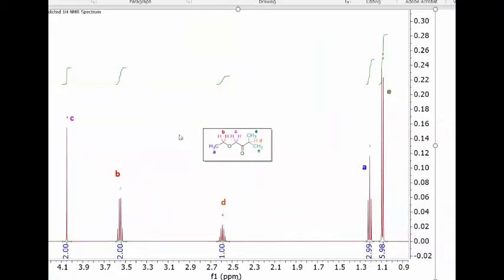Fine. So just to formally go ahead and wrap things up here, what I wanted to point out is that ahead of time we had predicted that there would be 3 methyl groups and that they would all collect around 1, and so in fact there are 9H down here and they collect around 1. We expected that 2 of them would lump together as a 6H group, and they have, and there was also going to be a 3H group. I made no predictions about which one was going to be further left, but if pressed, I probably would have leaned toward the thing closer to the oxygen. So chemical shift around 1 to 1.5 makes sense to me.